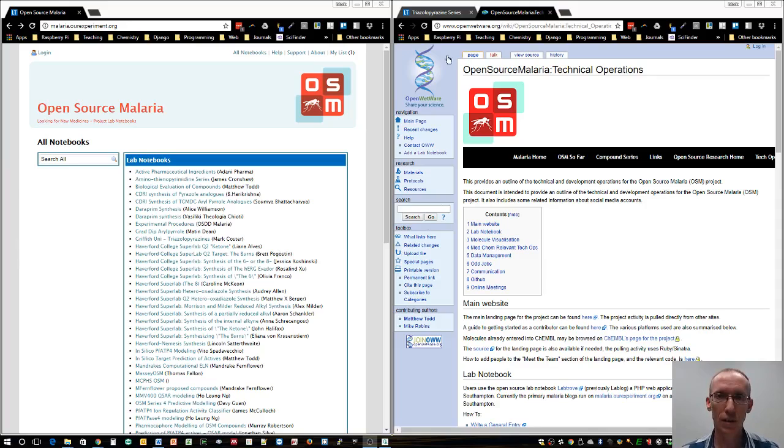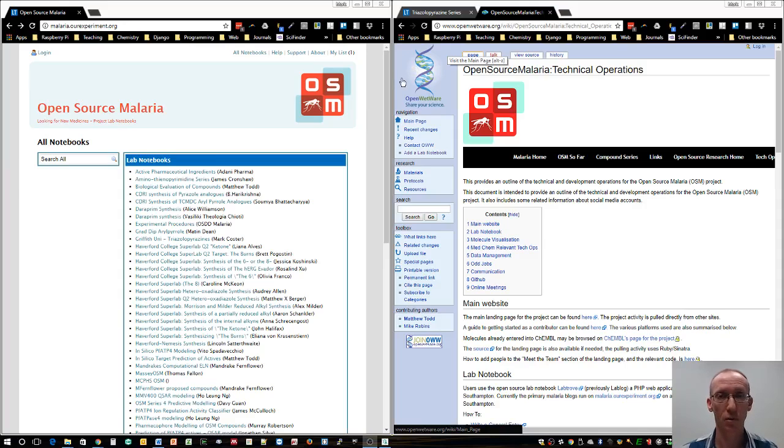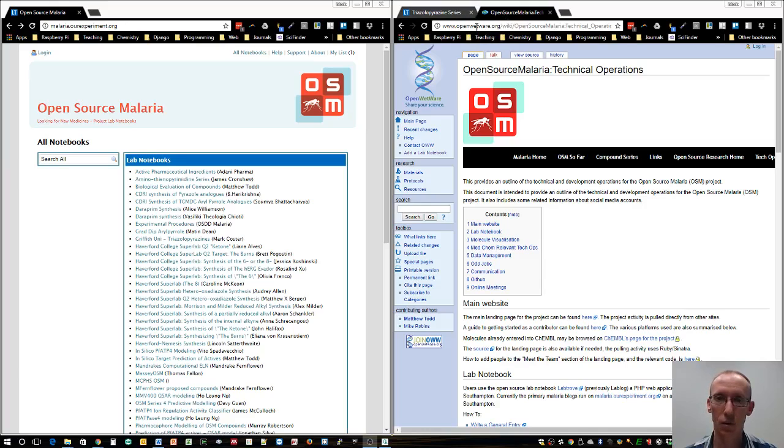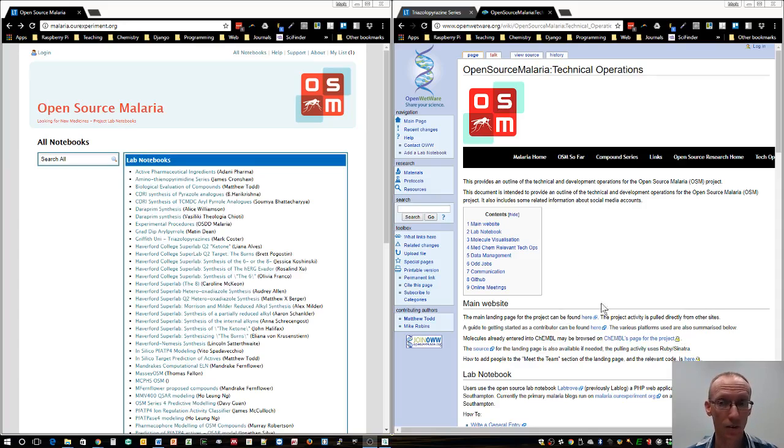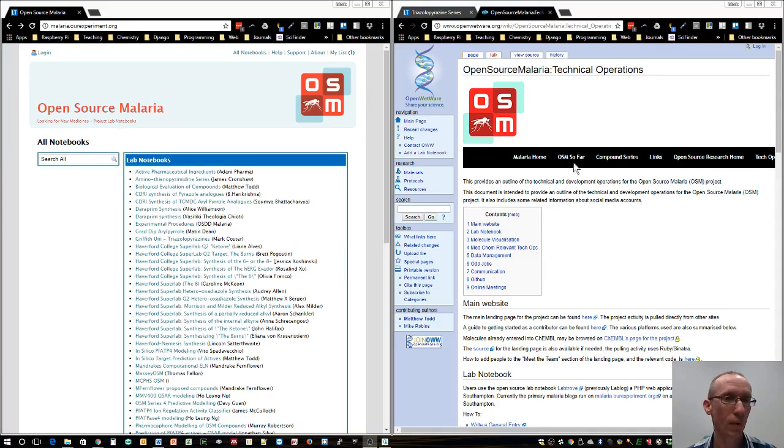There are three main sites that are important for sharing information around the open source malaria initiative. One is the openwetware.org site which is a wiki that goes through a lot of the background information about how to contribute and what compound series are being worked on.